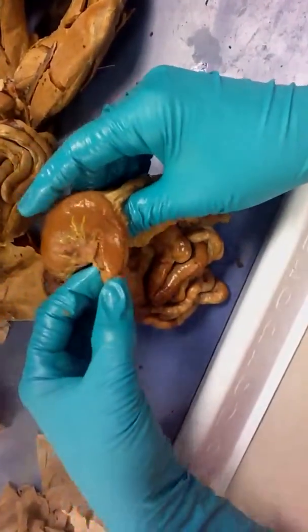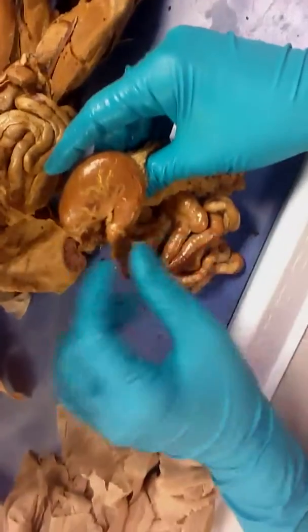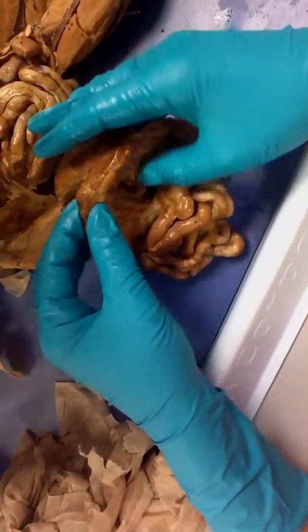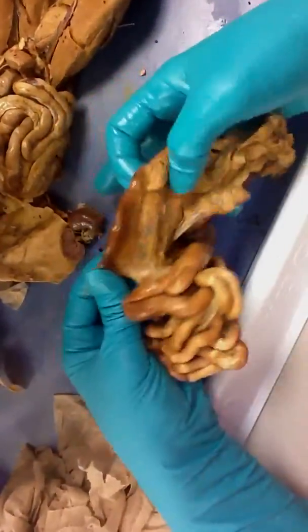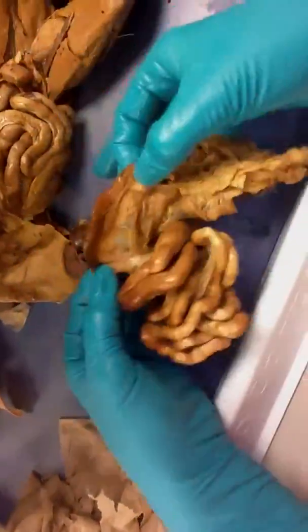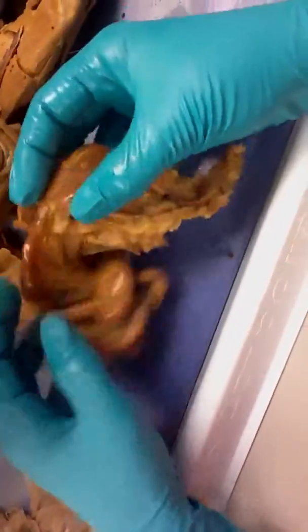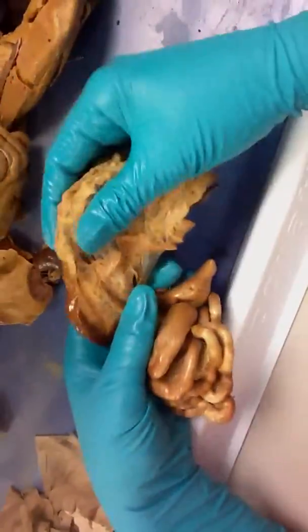And then it goes through, the pylorus is here, and then we have the pyloric sphincter. And you can feel this is a tough muscle right here. And then it goes to the duodenum. And you can see this is the first part of the small intestine. It's a very clearly distinguishable shape. It's before you get to all the twists and turns. And then right between it and the stomach lies the pancreas.